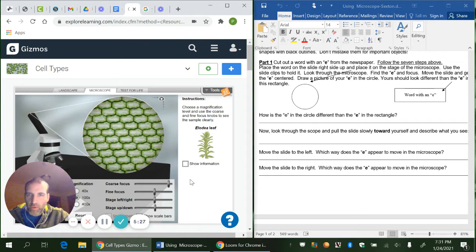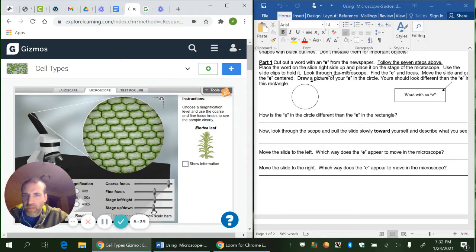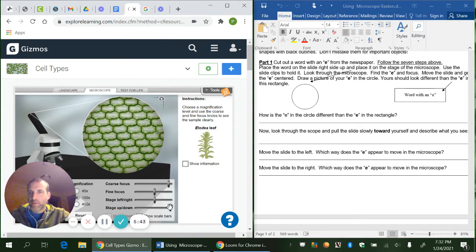It says to pull it towards yourself. So for me to do that, I'm going to pull it down on the stage. So watch what happens as I pull it down. What way does it look like it's going? Here, I'll do it again so you can see. If I'm pulling it down, it looks like it's moving up. And that's what you're going to need to write down. When you pulled it toward yourself, you would have seen that it moves up, like it's going away from you.